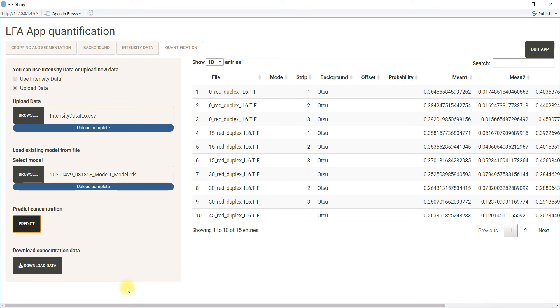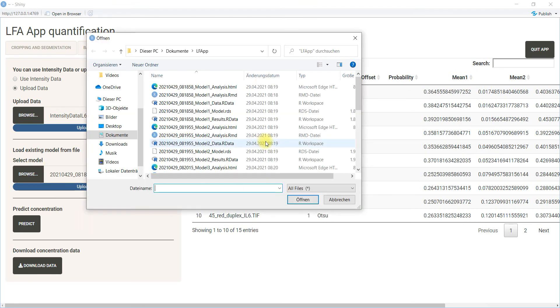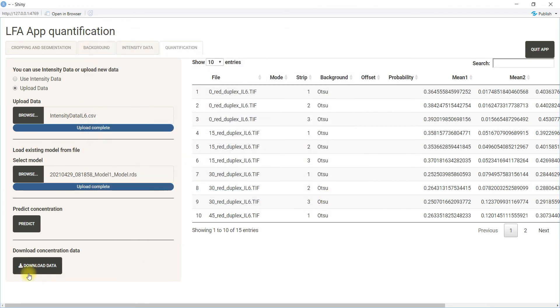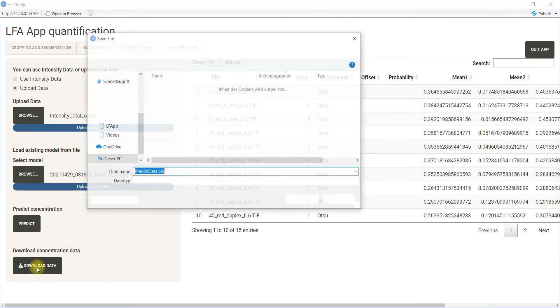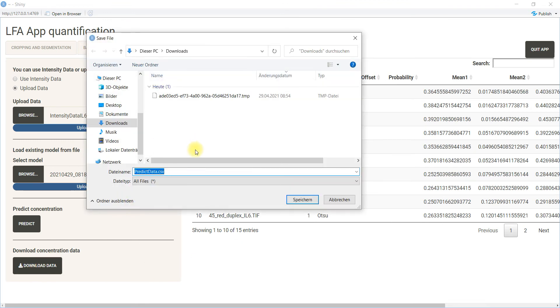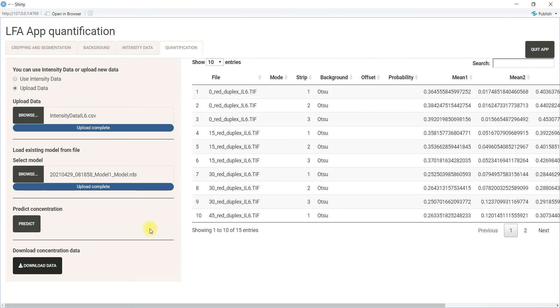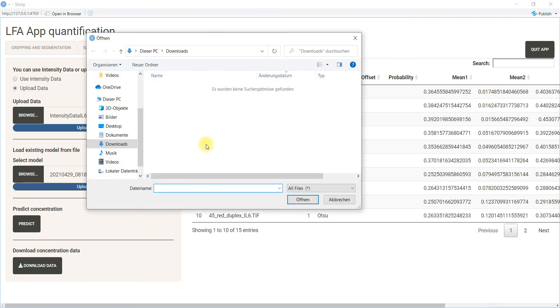You should now download this data and you have the results for model one. You can also upload another model.